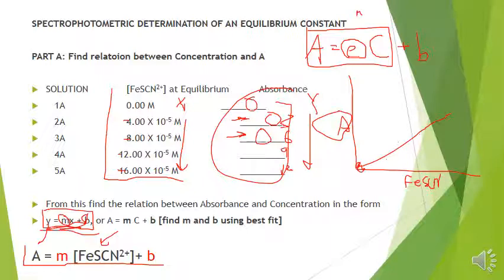Now this is called epsilon, and it's also known as the extinction coefficient. So this M here can actually be replaced by a little epsilon, and that's how we would do it if you really wanted to write this in a scientific paper: epsilon and then the concentration of FeSCN and so forth. But you don't have to do that. I'm just giving you an idea of how this is really written up. So you have this equation, and now we're going to go to the next step.